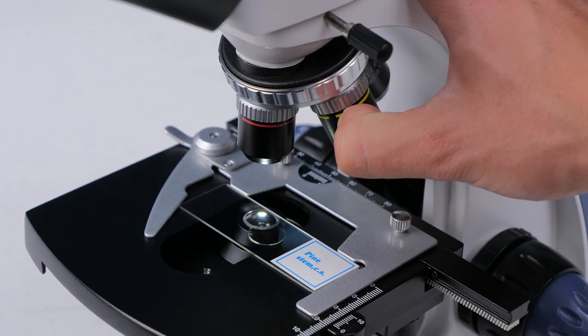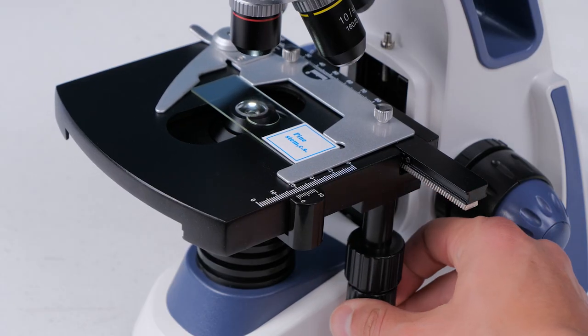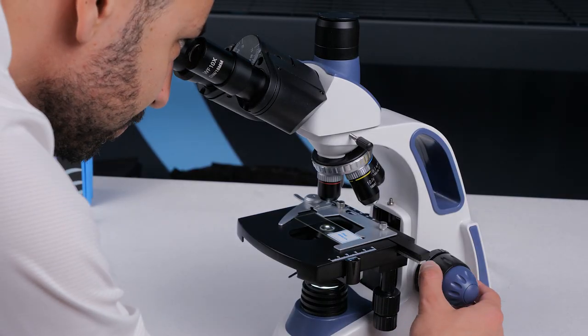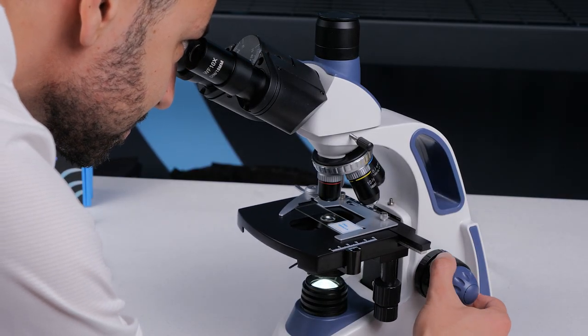Rotate down the 4X objective. Move the stage using the X and Y knobs so that your sample is in the center. Look through the eyepieces and turn the coarse focus knob to move the stage up until you have an in-focus image.